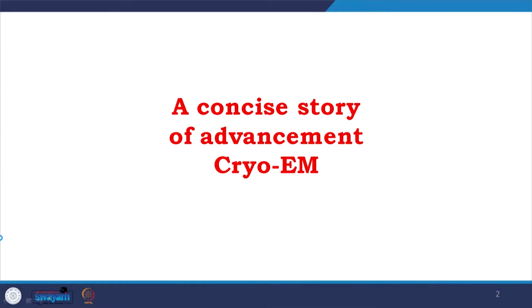I hope you will like it, because cryo-electron microscopy among the 3 high resolution techniques is considered the most potent one. How the technique has traveled, what the challenges were, what the journeys were, I am summarizing them in a way you could see how it came up. So, a concise story of the advancement of cryo-electron microscopy.